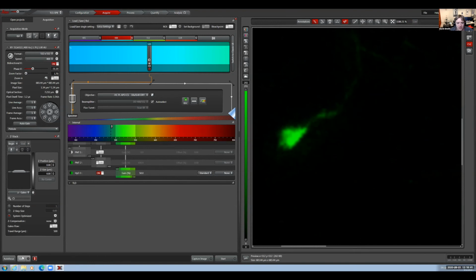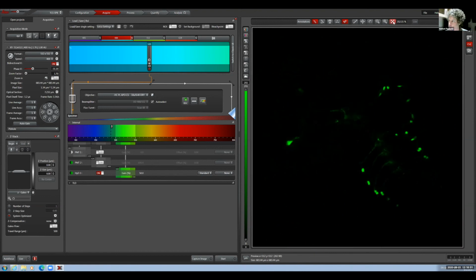But that's what bidirectional is. I think I clicked on stop. You did. And make it. So it's just taken a little longer than I'm used to to update. Yeah. So how is the video and the talking between us? It all sounds good and the video looks really good. It's just there's quite a bit of lag between one of us changing something on the screen and me actually seeing it update on my screen.